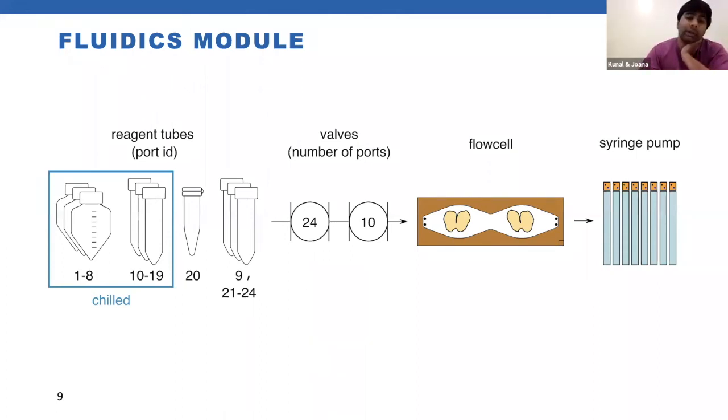We also modified the syringe pump a little bit. Normally each barrel is plumbed to each lane in a HiSeq flow cell. So there are 8 barrels, and each barrel has 250 microliters capacity. But we plumbed the 2 outlets of our flow cell to all of the inlets of the syringe pump so that we have the full pumping volume of the pump, which is now 2 mL. And the fluidic module is replicated for each flow cell and can be independently controlled.